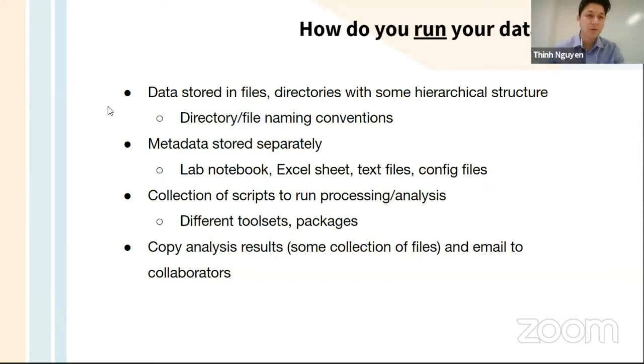And for the metadata, maybe you handwrite it in some lab notebook, or maybe you have an Excel sheet where you type in your meta information: subject number, session number, some sort of note, or experiment type, things like that. Maybe there are text files, config files. And then you would have a collection of scripts, Python scripts, MATLAB scripts, or packages, tools that you would run your analysis on.